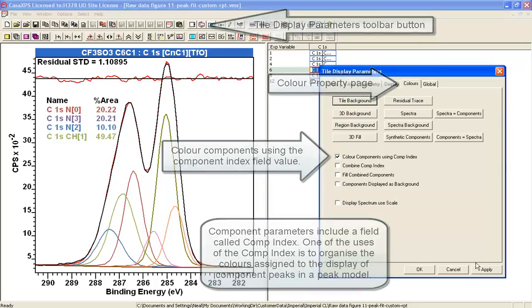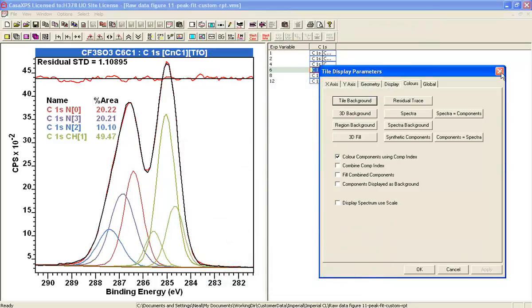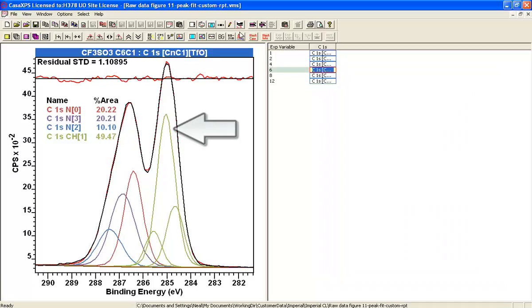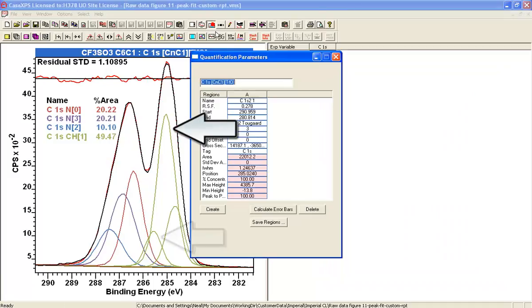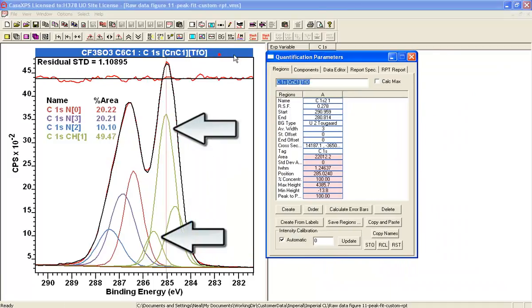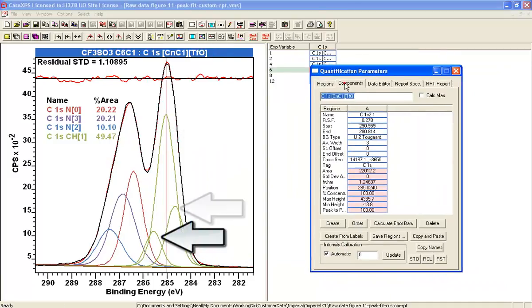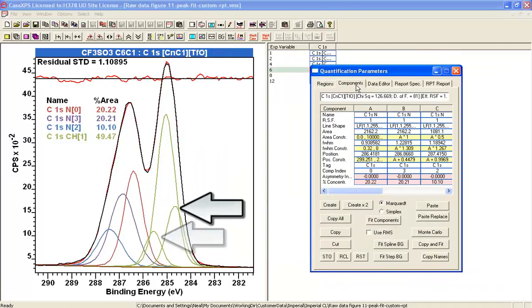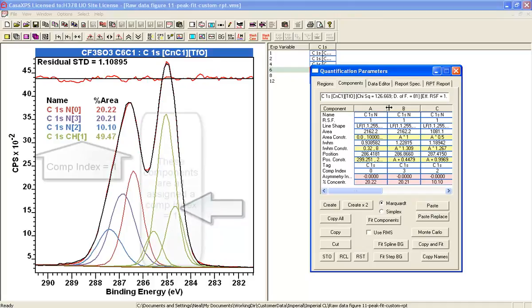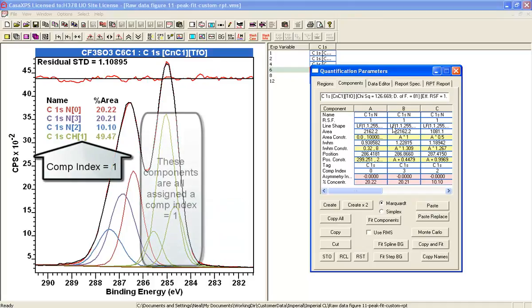When I do that, I get the components colored no longer by the order of the components listed on the components property page — A, B, C, etc. I now have the color coding according to this component index.